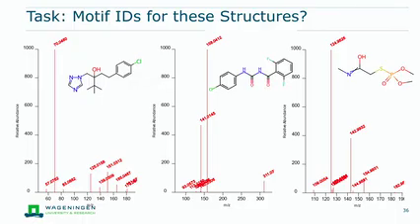So I explained at the beginning there is the possibility also in the visualization app to run your file. This file is normally an MGF file, it could also be an MZML file. Best would be if it's pre-processed, MZMine, MS2LDA or so. And then you upload in the tool your MGF file, run the tool, and then it will automatically generate a JSON or JSON zipped file. And this can then be used for the visualization app. You can also run it on your laptop or a colleague and then upload it as we do it to the server or so on, if it's not that overcrowded, of course.